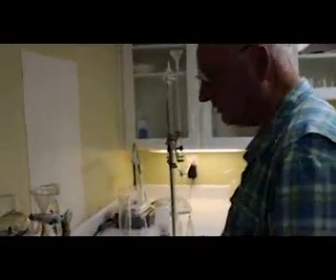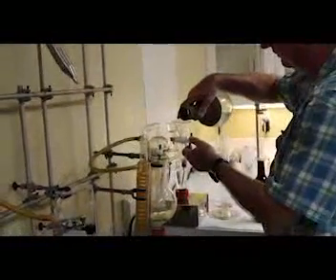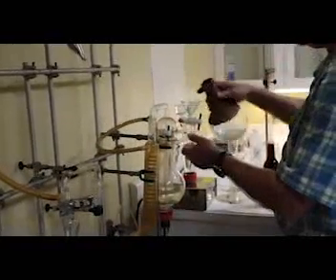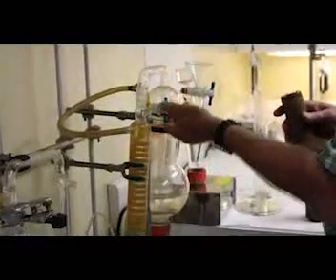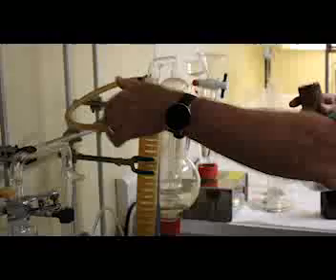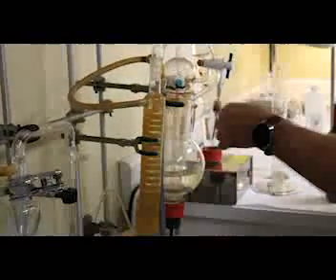So we're going to start, we want to first off make sure that it's well rinsed, and I'm sure that Mollie here, who's running the camera, who runs these tests regularly, has rinsed this already, but I'll do it again. You just fill it up. That goes into the area where the wine goes, and you open the petcock. And this is hooked up to a vacuum, water vacuum, that is pulling that sample out and rinsing it out.